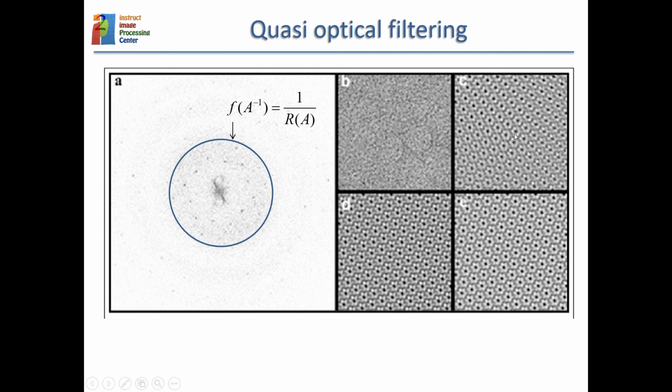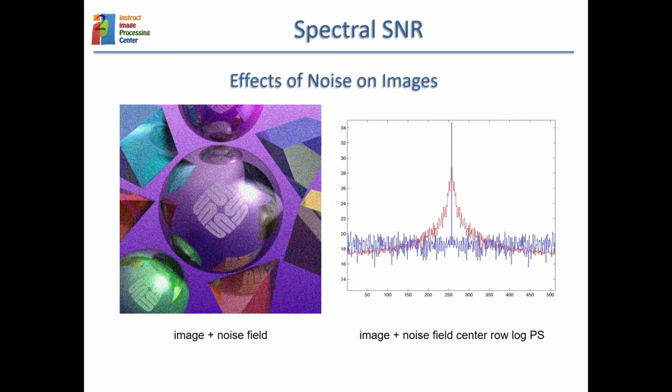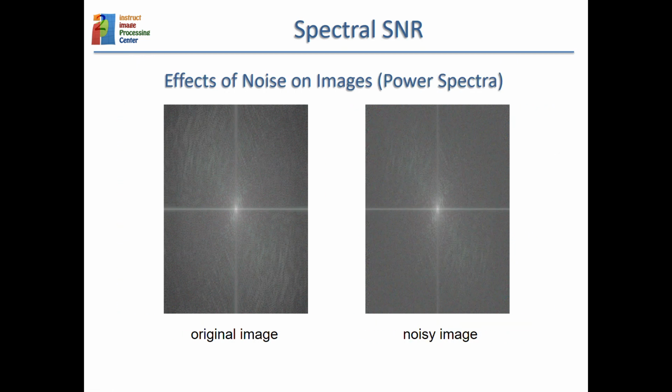Now you have a much cleaner version of the image underneath, and what we have removed is just the noise. It is the same as we did in this previous example, but now by designing our kernel based on the location of the Fourier coefficients.